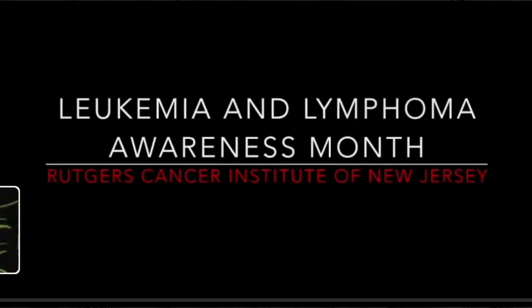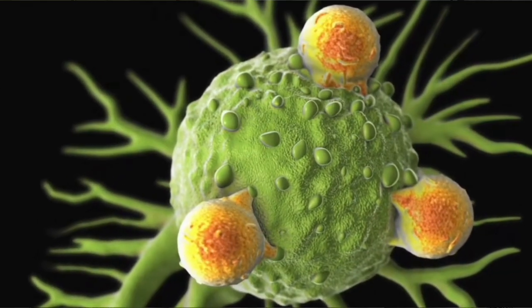There are multiple uses of flow cytometry methods in multiple diagnostic purposes at present. For example, hematology and immunology. We can detect leukemia and lymphoma using this technique.